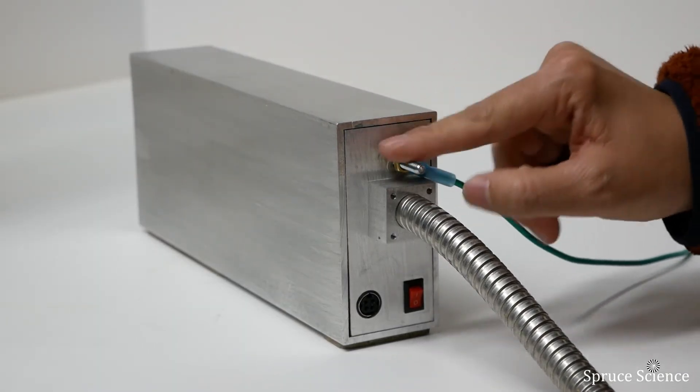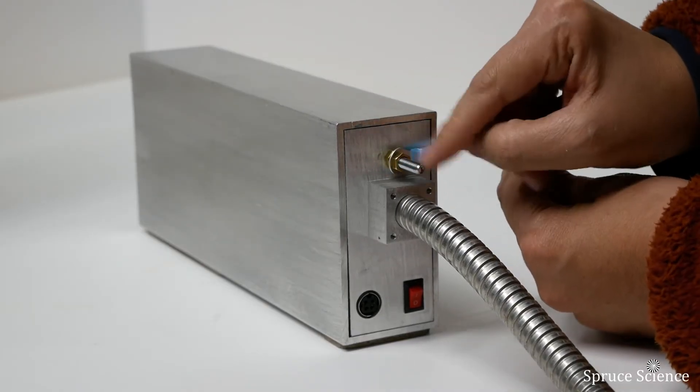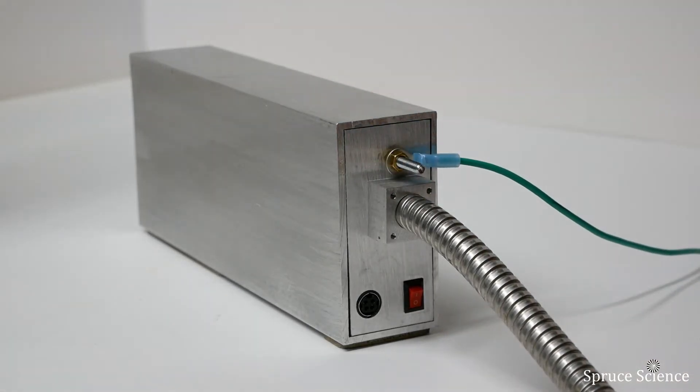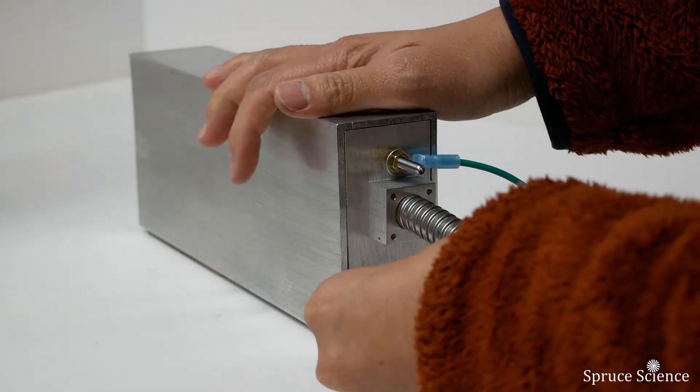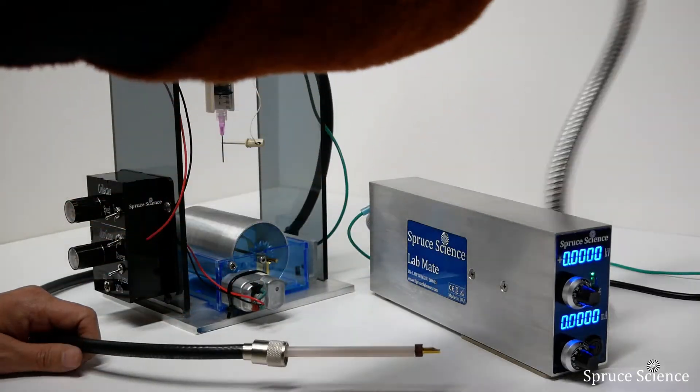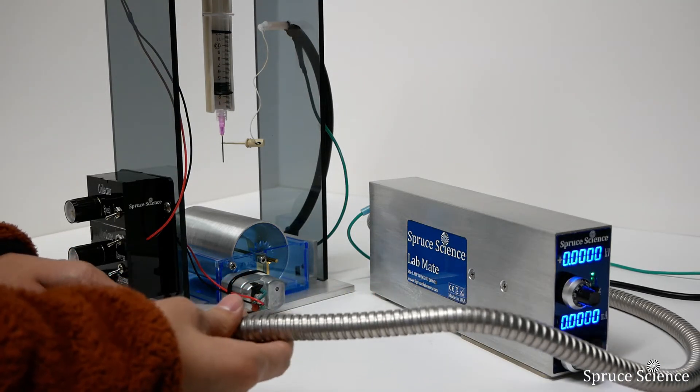Proper grounding is very important. Make a secure ground connection between the high voltage power supply and earth ground. Make the 24 volt connection. Connect the high voltage power supply to the drum tower.